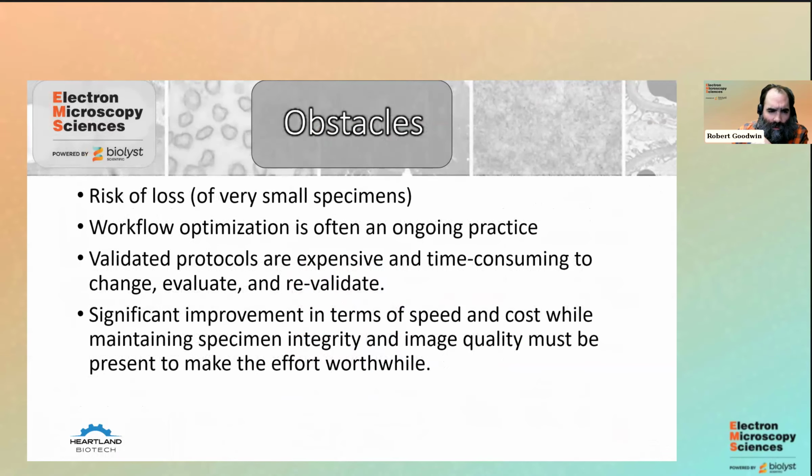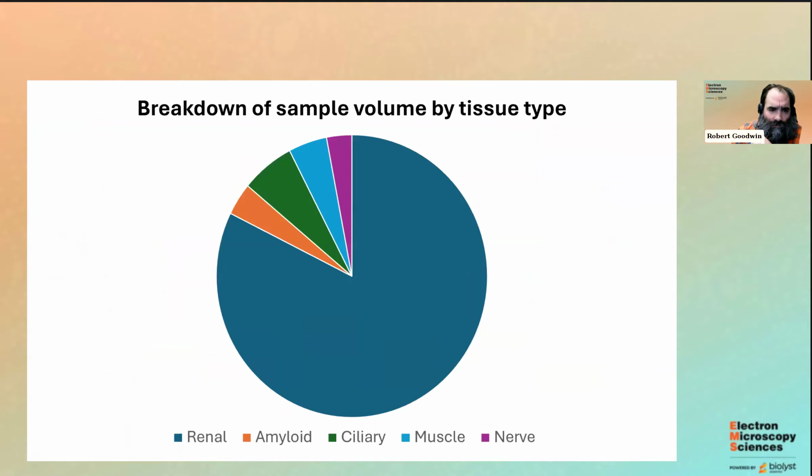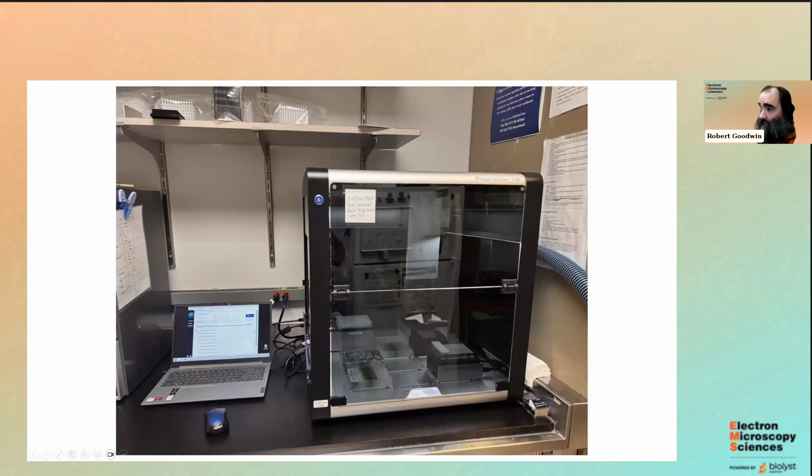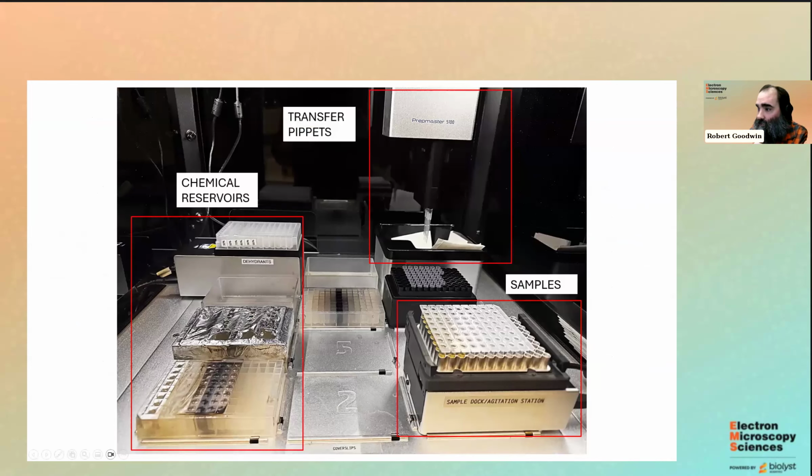On here, you can clearly see where our osmium is deposited. There is a hose connected to this, and you can see in the previous picture that this is enclosed. You can see on the side the hose coming off, venting into a fan in our fume hood that sucks everything out, so there's no worry about fumes.